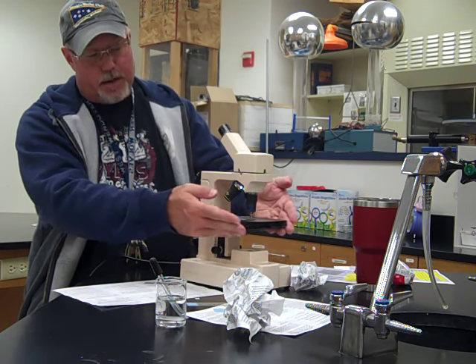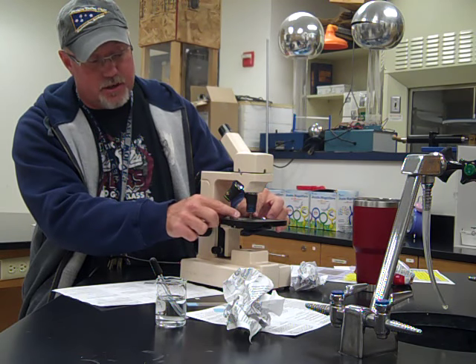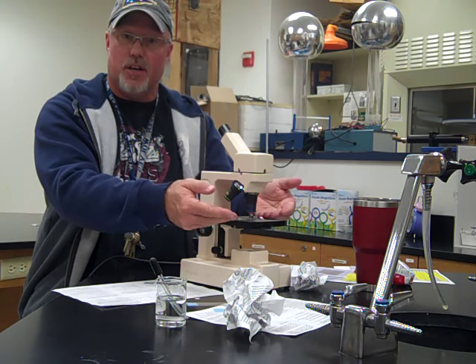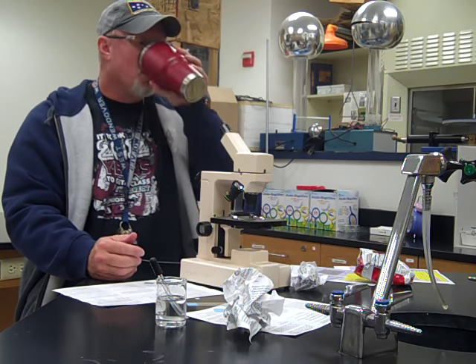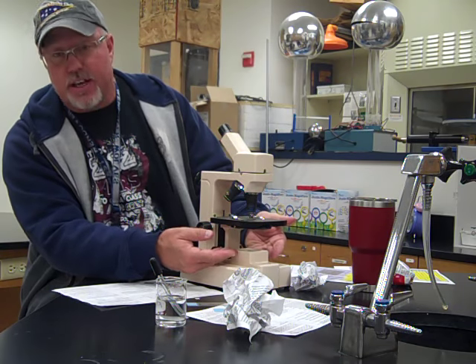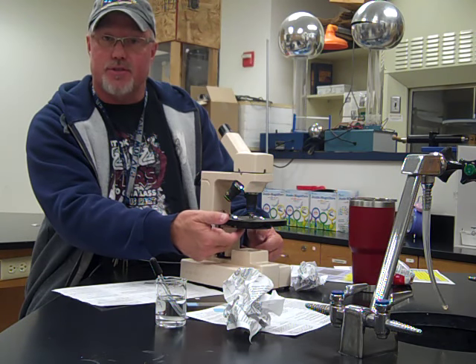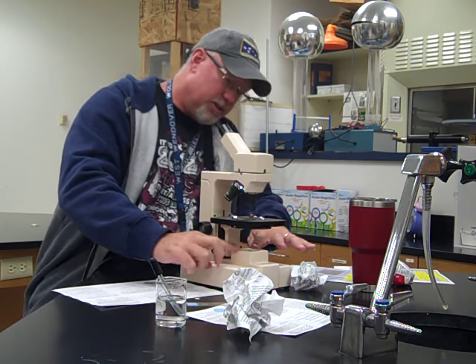Below the objectives, the black part here is the stage. The silver objects you see here are the stage clips. This is what holds the slide in. The stage is what everything sits on. That's why we call it a stage, because it's where you present the material. After that, underneath the stage, you have the light source, or the illuminator. This sends light up through the stage, through the lens that's in there, and it illuminates what you're looking at. So the light source is right here.